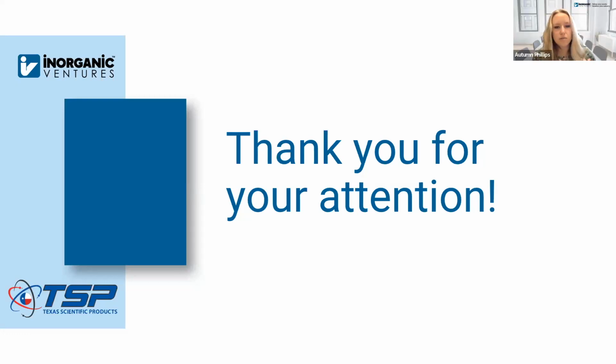Thank you, Sergei. That was a great presentation. I'm just going to start going through the Q&A so we can get some of these questions answered. So the first question, Sergei, is, I'm extremely new to ICP. What is the difference between ICP mass spec and ICP-OES, and when is one preferred over the other?